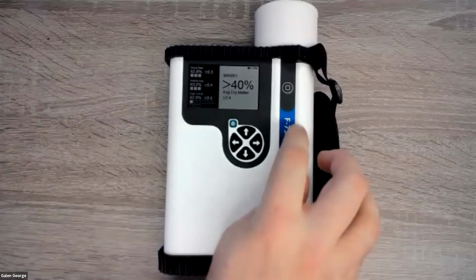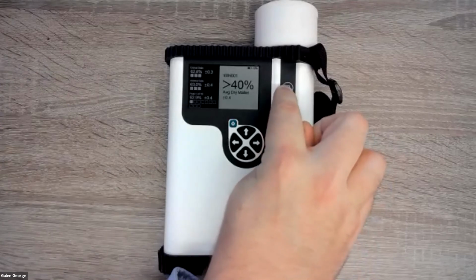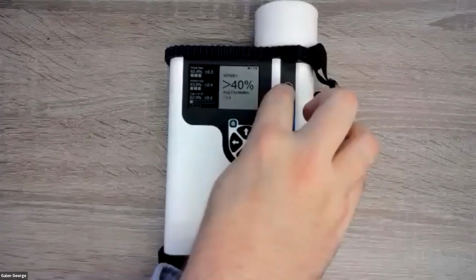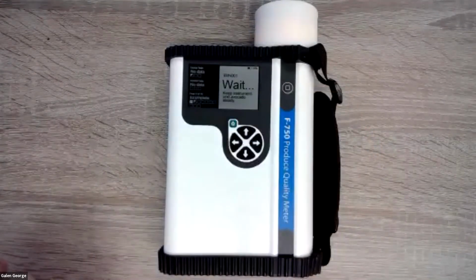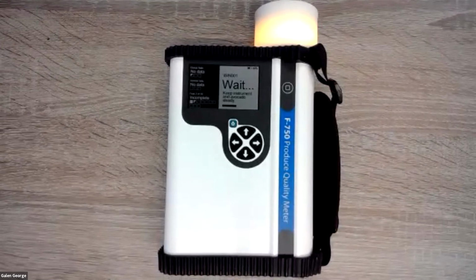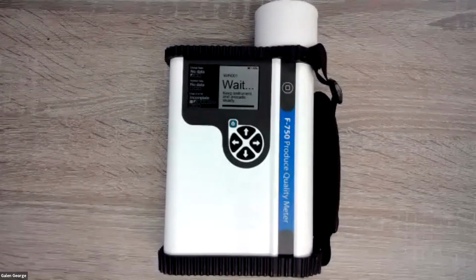For instance, if I was done with this fruit and I want to take the next scan of the dorsal side of avocado number 2, I click the button. And we're going to see it automatically go through those 3 scans. It'll take triple the amount of time it would normally take for 1 scan, but I won't have to click the button 3 times.